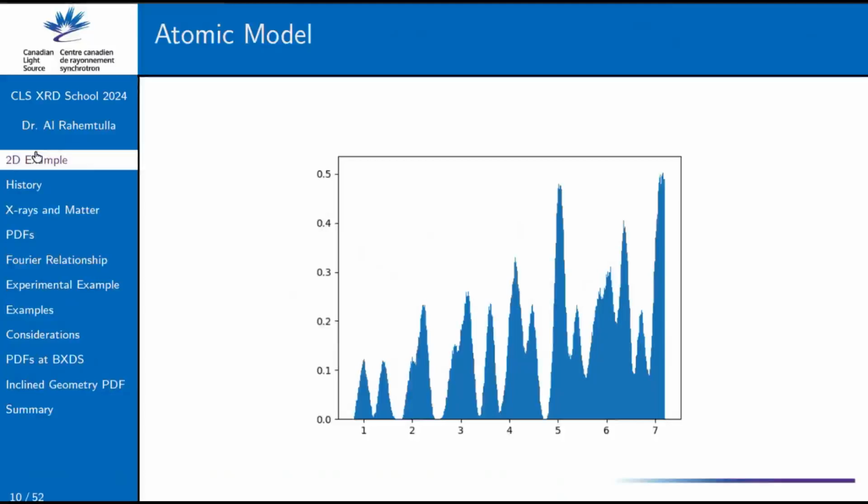And we can see these three are the same, and when we get to that fourth peak there's twice as much, and we see there's twice as much. Because it's a 2D model, you can see this trend has things increasing in a linear fashion, because as our circle gets bigger, it's going to increase by r. If this were 3D and we were doing a sphere instead of a circle, this whole thing would be trending up by r squared.